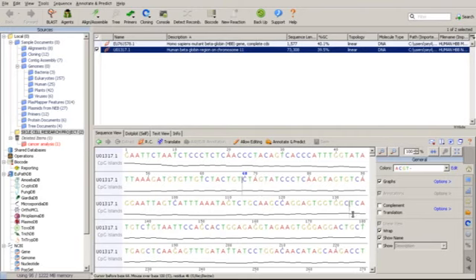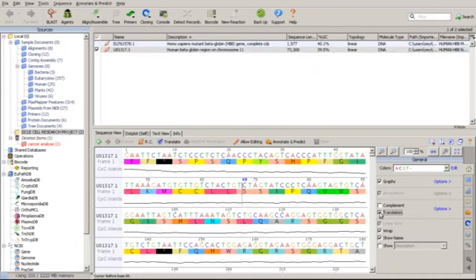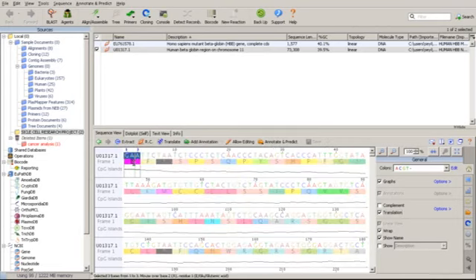So for you to work on translation, all you need to do is click here, as you can see. We've talked about complement, so we're going to translation. Just click translation. As you can see, presently on your screen, these are the 3 nucleotide bases that code for an amino acid E, and this E signifies glutamic acid.